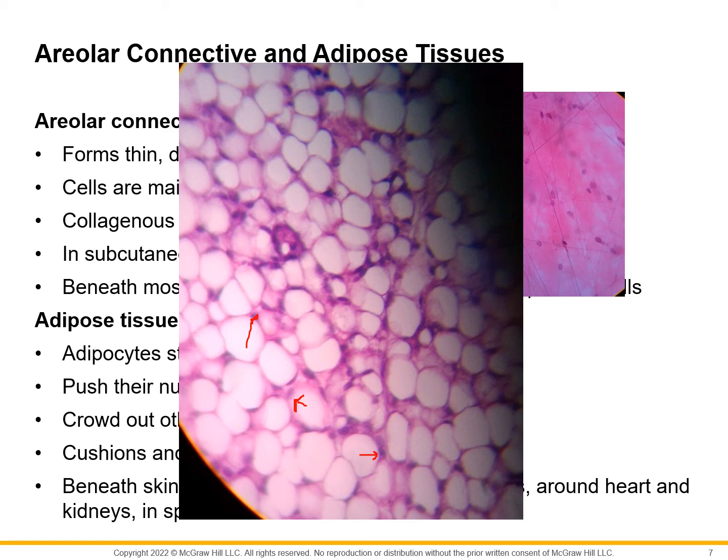The big thing, looking at it in the book, is that there's only a few big nuclei around each one of those spots, unlike the simple squamous, where in the round spot, which is just empty, you've got dozens of little nuclei around it. But the real easy way to see it is the tissue damage aspect of it.